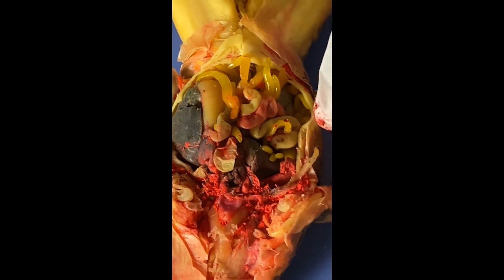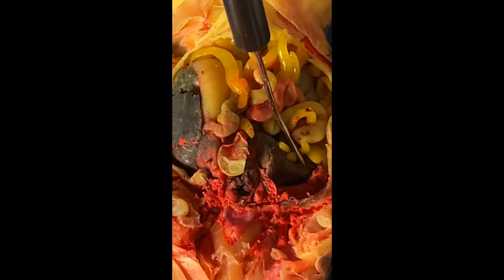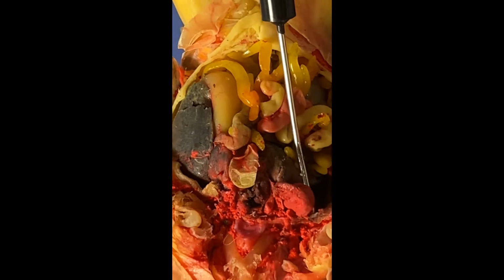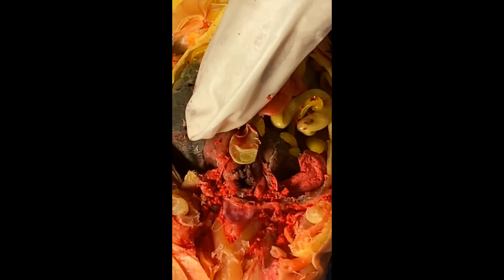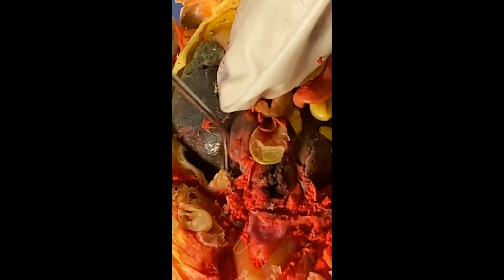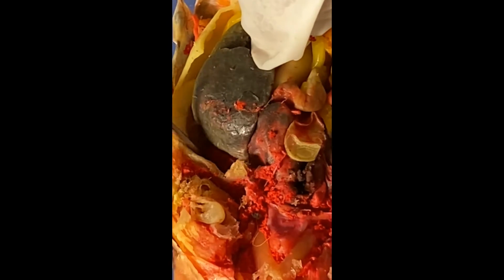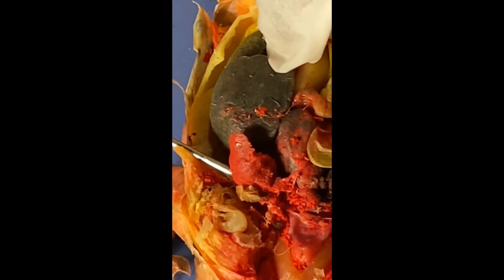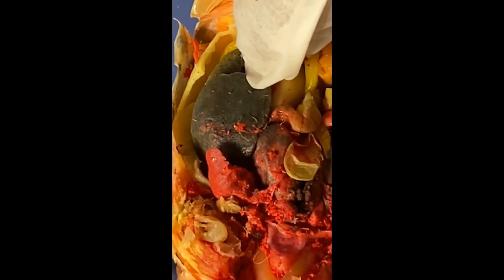The liver is in charge of secreting bile to digest the food. And underneath the liver are the lungs. There are 2 lungs. So there's one over here, it's pink, this one. This is 1 lung. And there's another on the other side. And another over here. So these 2 are the lungs.